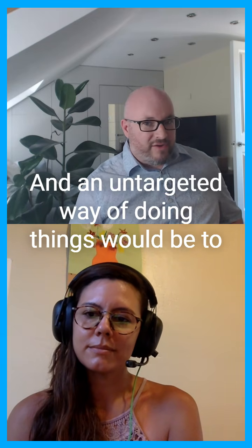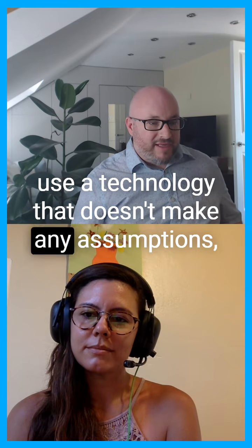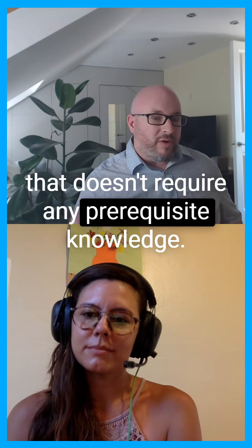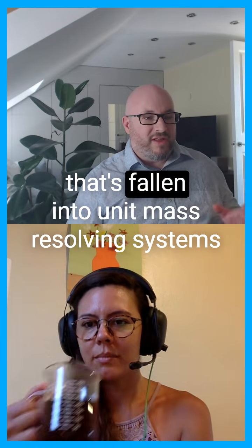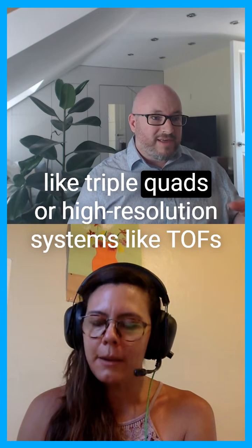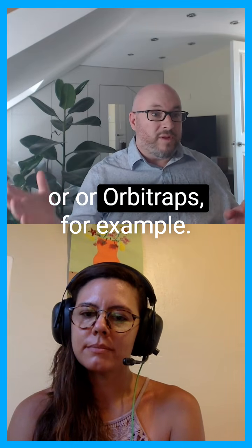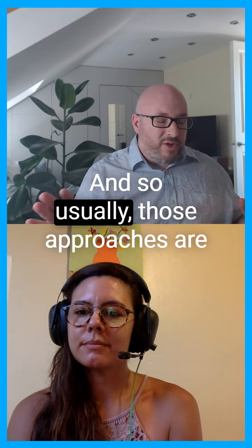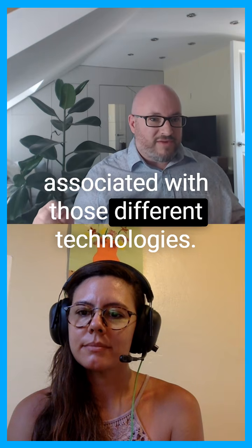And an untargeted way of doing things would be to use a technology that doesn't make any assumptions, that doesn't require any prerequisite knowledge. And so in our world, conventionally, that's fallen into unit mass resolving systems like triple quads or high resolution systems like TOFs or Orbitraps, for example. And so usually those approaches are associated with those different technologies.